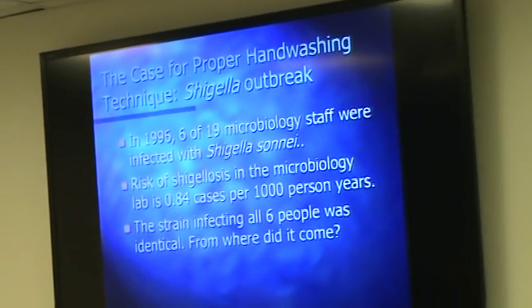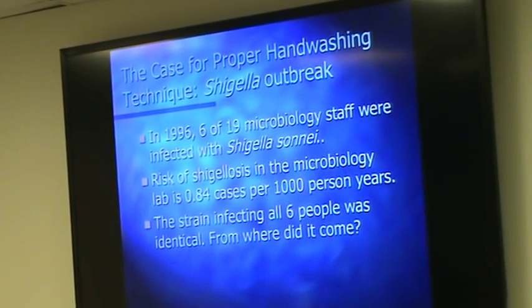It might not be occupational exposure at all, but I've had students that have had allergies, and they come and say something's wrong with my hands, and you can just see it, from there down everything's red, from there up everything's fine. Well, clearly that's a problem with the glove that we need to do something about. So just a reminder that it's incumbent upon you to tell folks. Now, when the gloves come off, you need to still hand wash or perform hand hygiene.